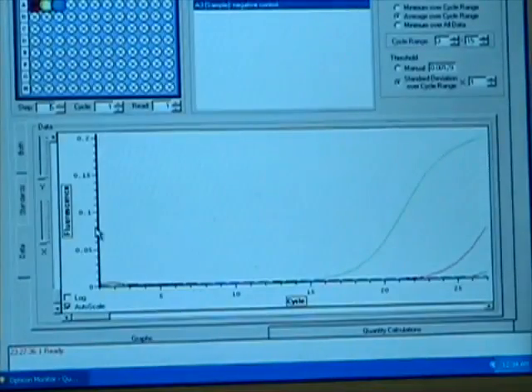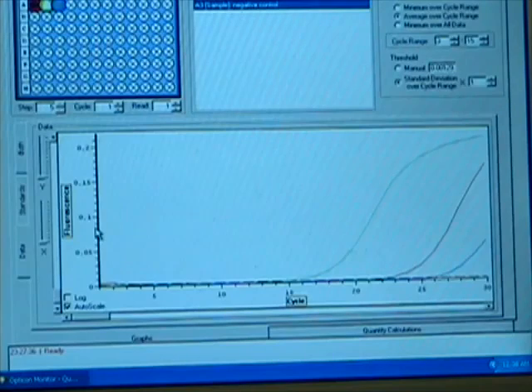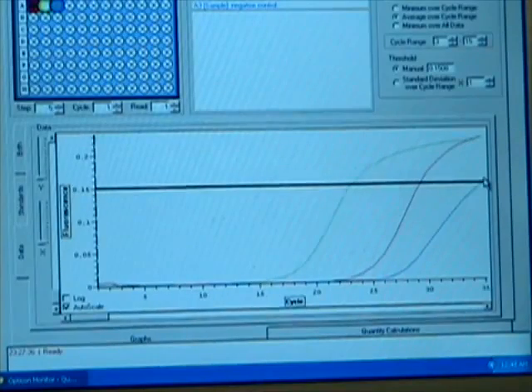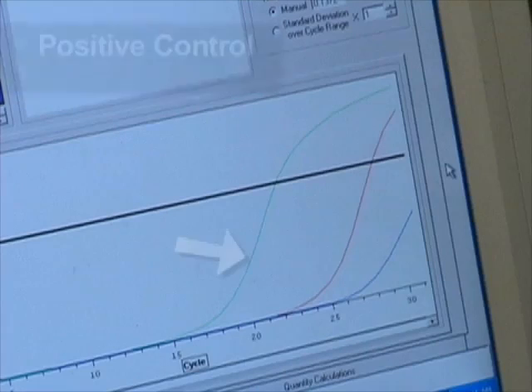At this point you can see the negative control just starting to come up, and that's because I took an excess of tail. That helps you be sure that anything that comes up before this excess negative tail is going to be positive. So at this point, anything that is coming up before the negative, I would consider positive, and I would proceed with my experiment.